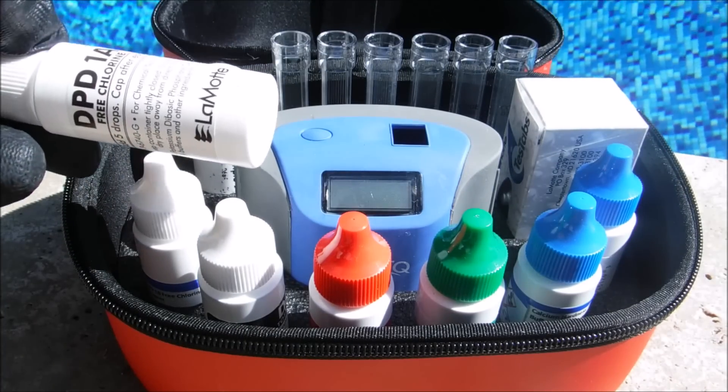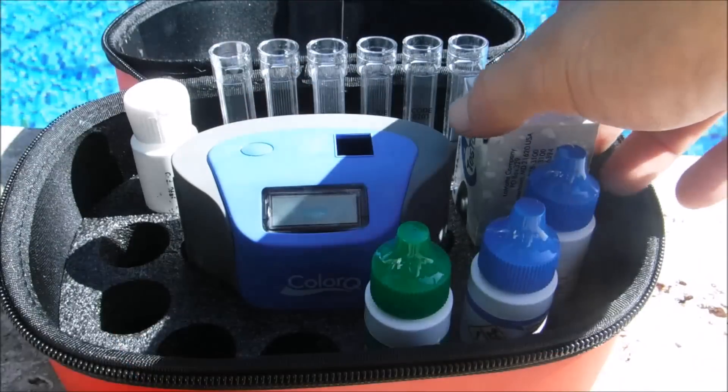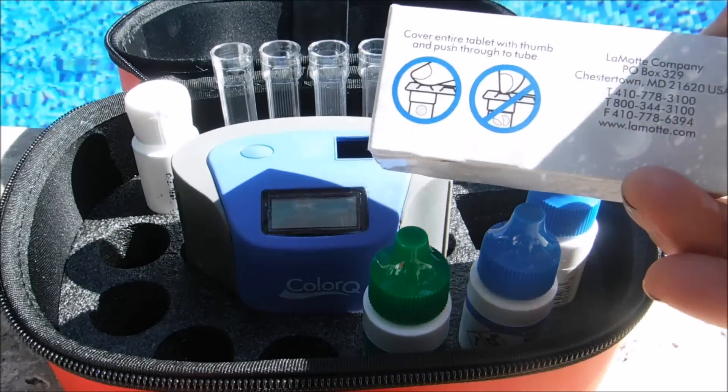It comes with enough reagents to do 144 individual tests. It also comes with enough cyanuric acid tablets for 100 tests.